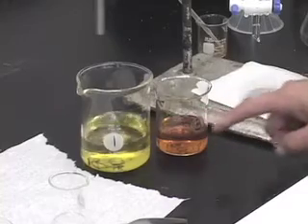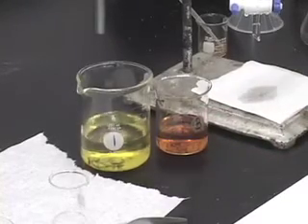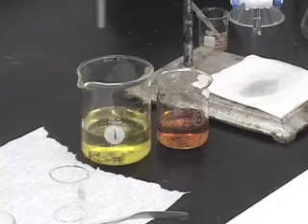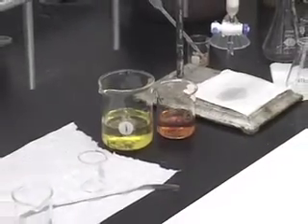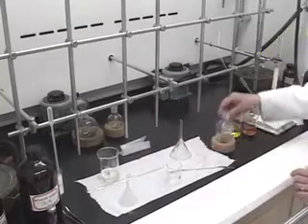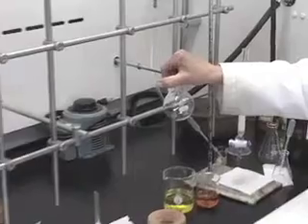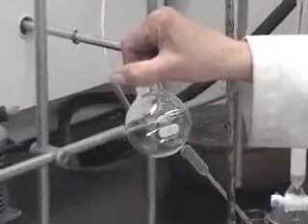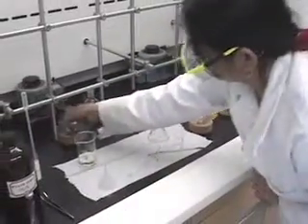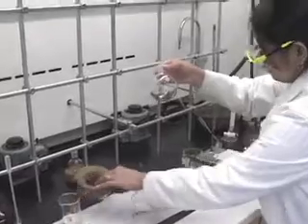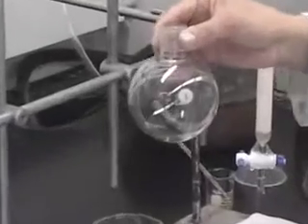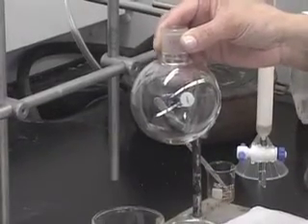We want to transfer these two solutions to pre-weighed round bottom flasks. What do I mean by pre-weighed? You have weighed the empty, clean, dry round bottom flask and noted its weight. I have one 100 mL round bottom flask—clean, dry, and pre-weighed. I also have a 250 mL round bottom flask, also clean, dry, and pre-weighed.